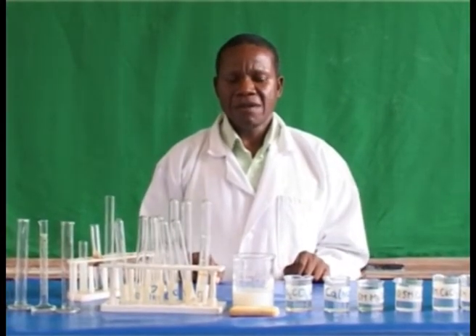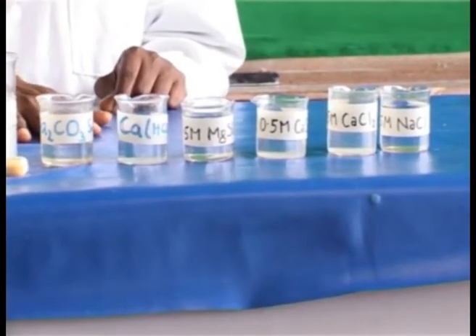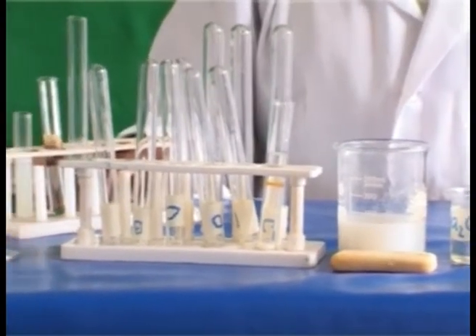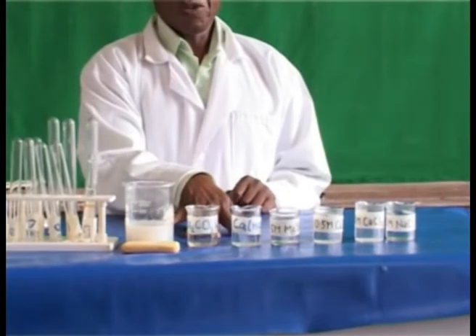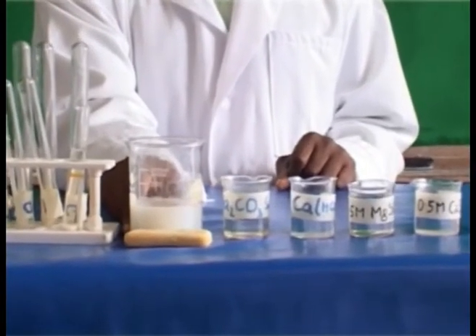Requirements. Apparatus: 7 beakers, 9 test tubes, 2 test tube racks, 3 measuring cylinders. Different salt solutions and soap solution.